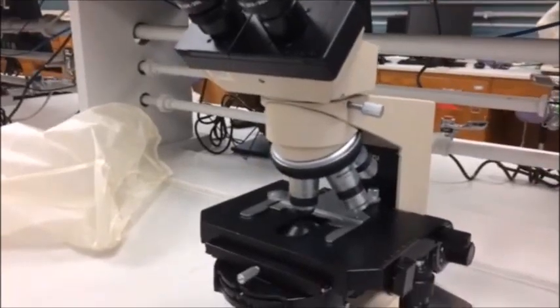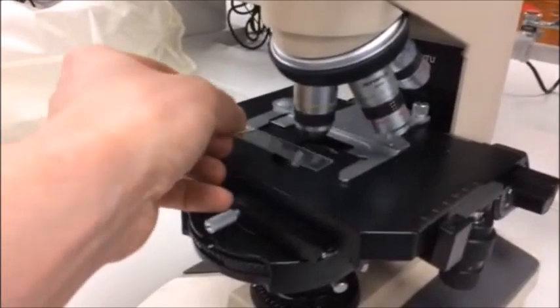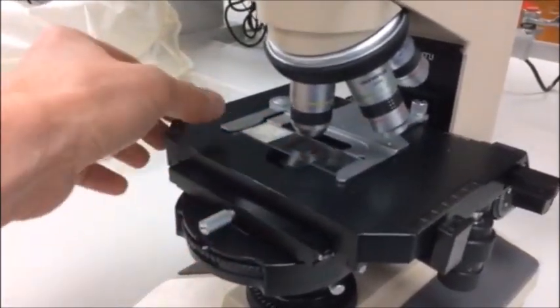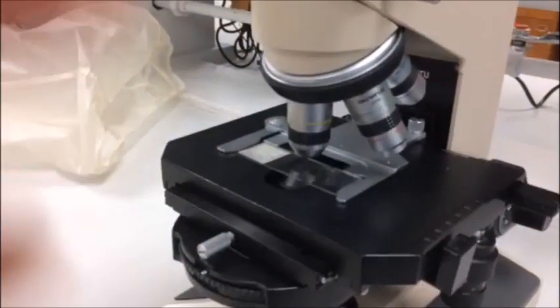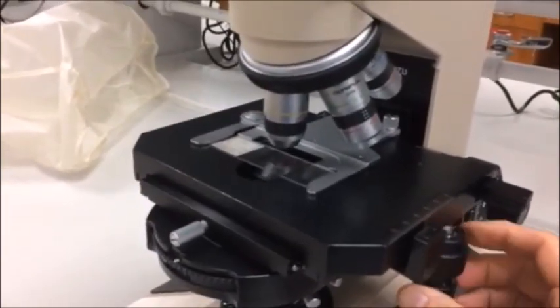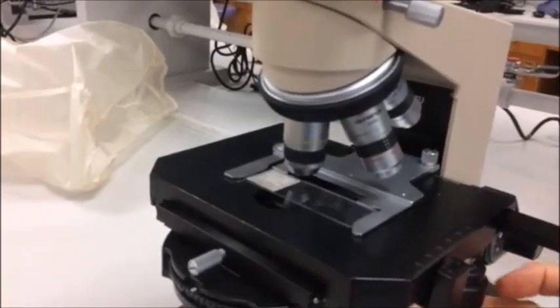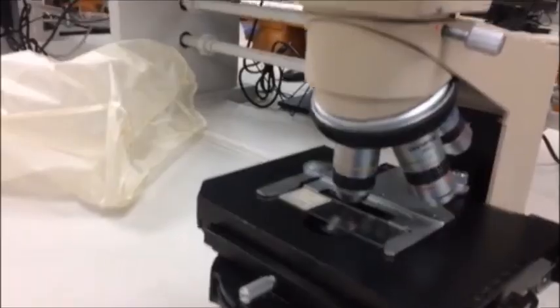So one of the things that some people don't ever figure out is that this microscope actually has what's called a mechanical stage. So when you put the microscope slide in here, there's a little clip that holds the slide in place. And underneath, there are some little knobs that you turn that move the slide back and forth underneath the objective lens, which is right here.